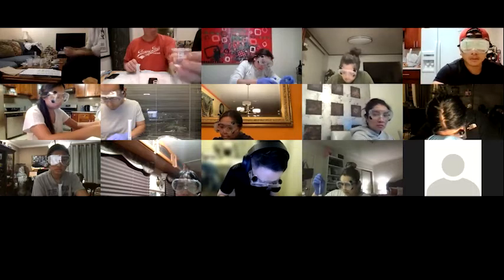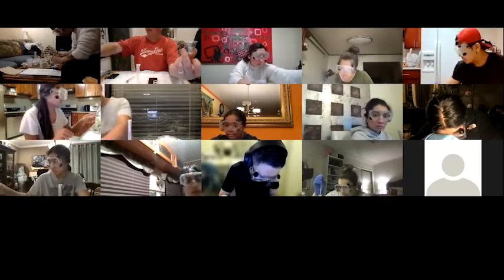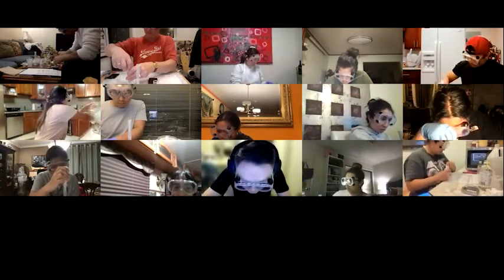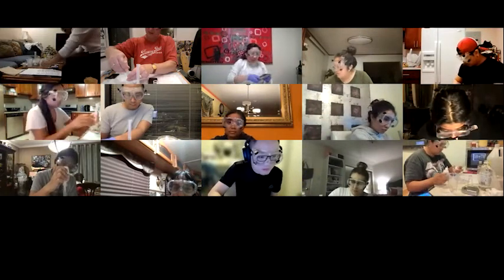So we put sodium hydroxide in here. You get it in a squeeze bottle. You have to squeeze this for a good long time to get enough sodium hydroxide in here, and then just draw it up. If you don't have exactly 10 mils, it does not matter.